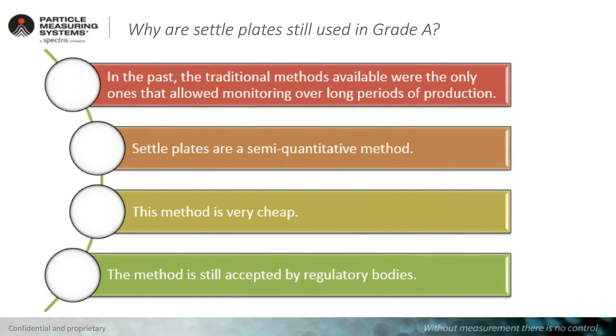So there is a question: why are settle plates still used in grade A? Knowing now all the scientific difficulties, the question is really why these settle plates still have a value, or don't they have a value at all?